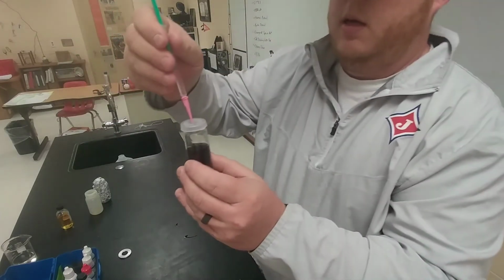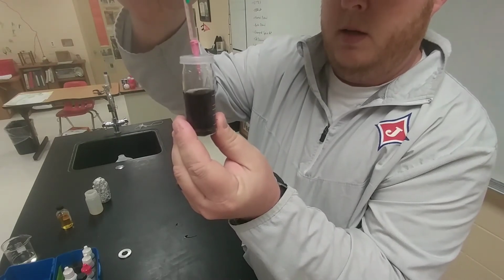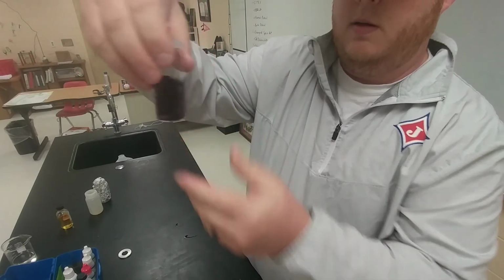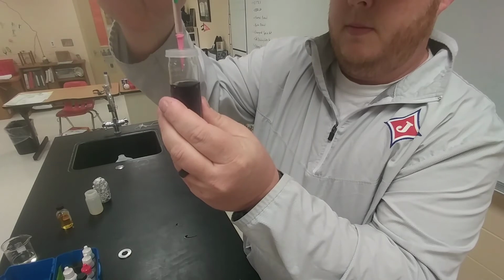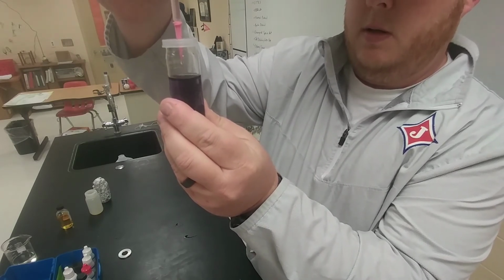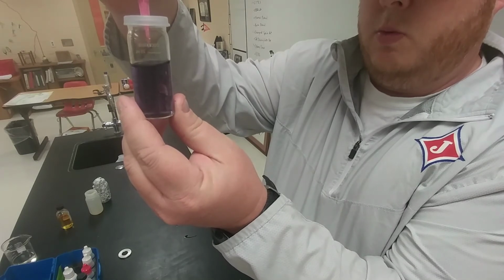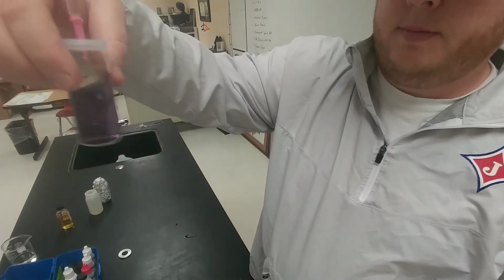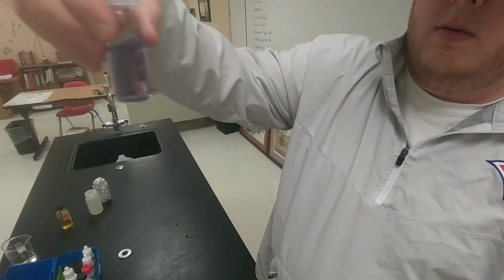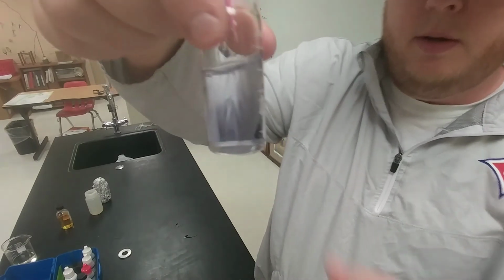And the next thing I'm going to do is titrate until that blue color disappears. So just 1 or 2 drops at a time. It's really turning. 2 drops there. All right, 1 or 2 more drops ought to do it, I think. There's 1, 2. Let's see if that does it. 1 more. Maybe 1 last drop to turn it clear. Turns clear right there. Okay, so that's clear.